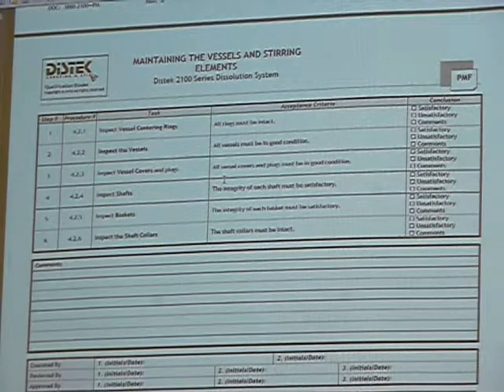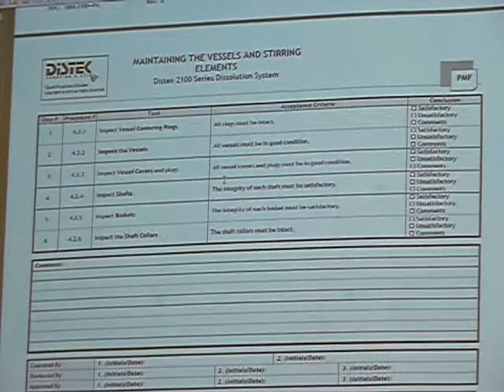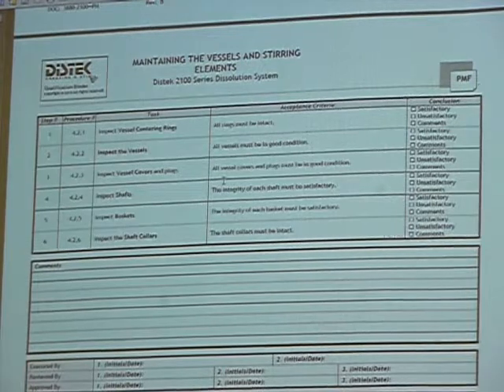Yeah. It breaks. Any hard plastic on the device, I mean, that's not a lot of things. We've done it ourselves as designers of the bath. But a lot of people out in the world just don't really understand until you start working on these things for a number of years. It's hot, it's 37 degrees, and all that heat is rising all the time. And all that heat, over time, is making everything above it that's made of plastic brittle. It gets old and it gets brittle and has a tendency to start breaking whenever you apply any kind of force to it. So always bear in mind that anything on that bath that's sitting above it, where it's getting heated all the time, is susceptible to that.